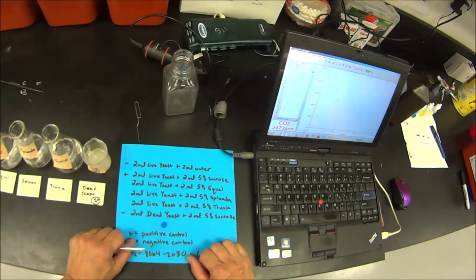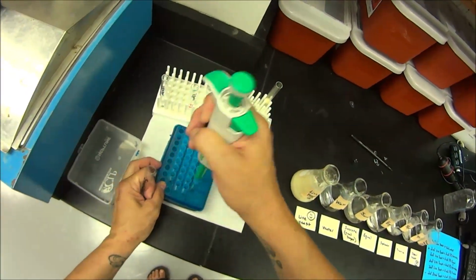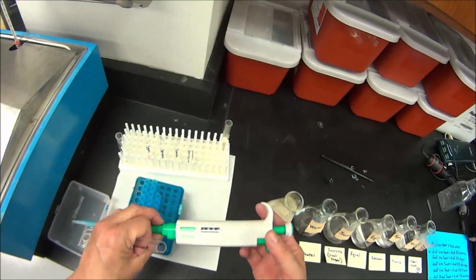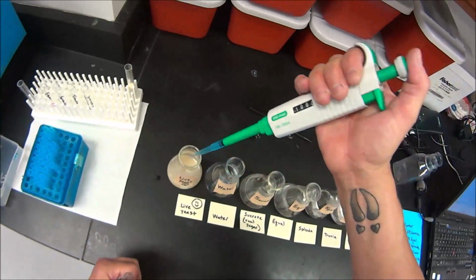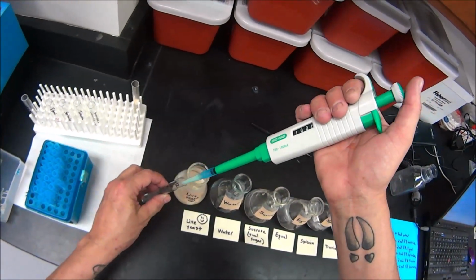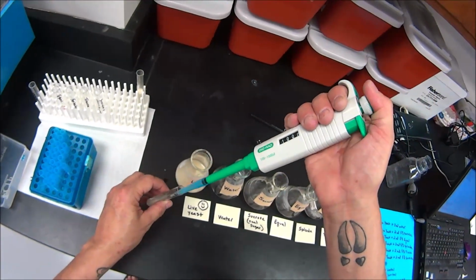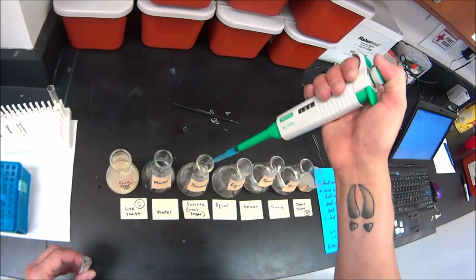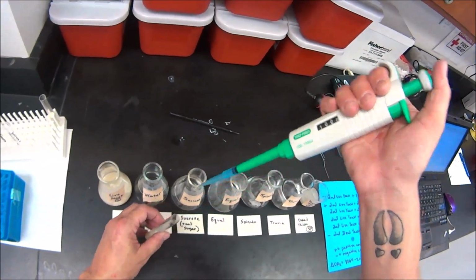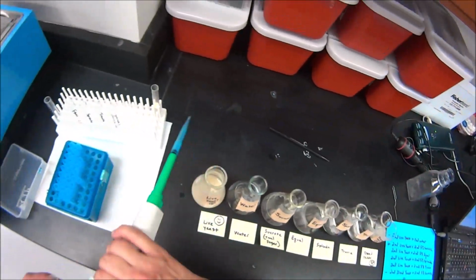So here's what we're going to do. We're going to move over to the pipette bench. I'm going to put a pipette on. It's a 1,000 microliter pipette. That's 1 ml. And to that, I'm going to add 1 ml of my live yeast. Here is another ml. Awesome. Okay, and then I'm going to make up the sucrose solution. So I'm going to put 1 ml of sucrose, the table sugar, the real sugar. Okay, we are ready to go.